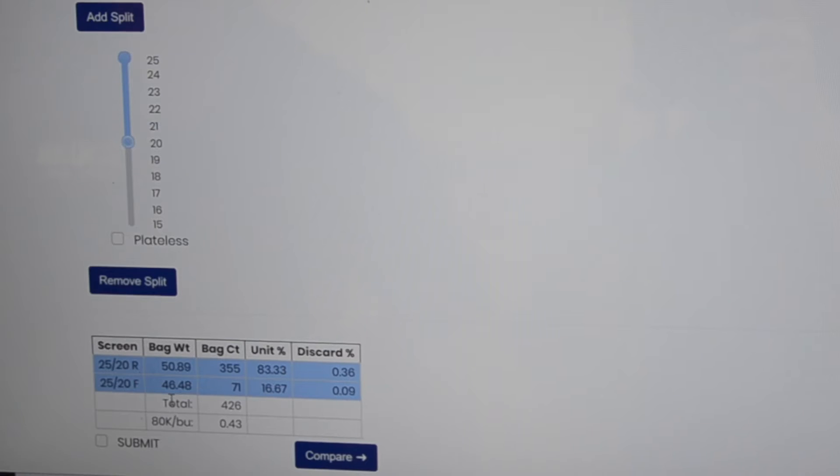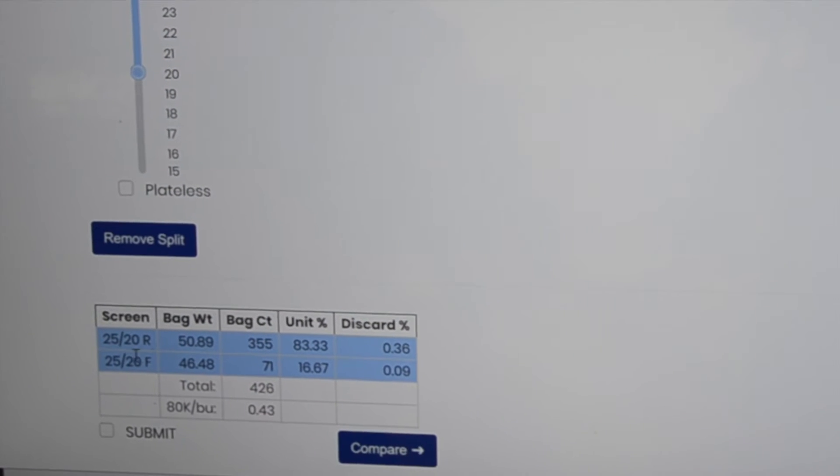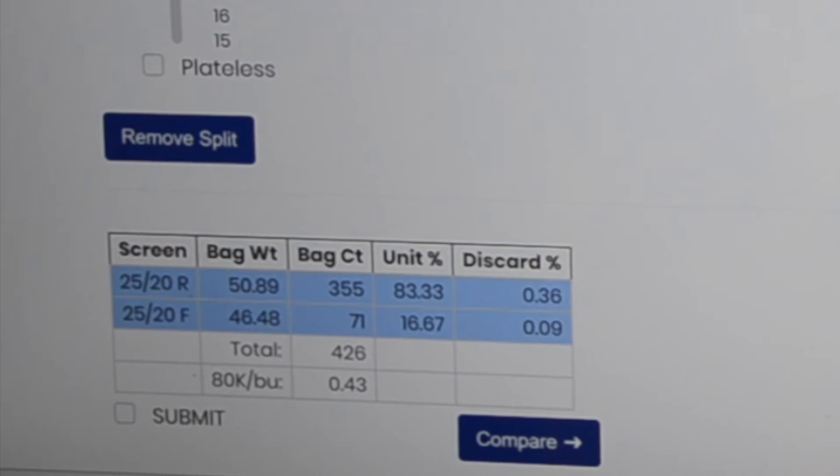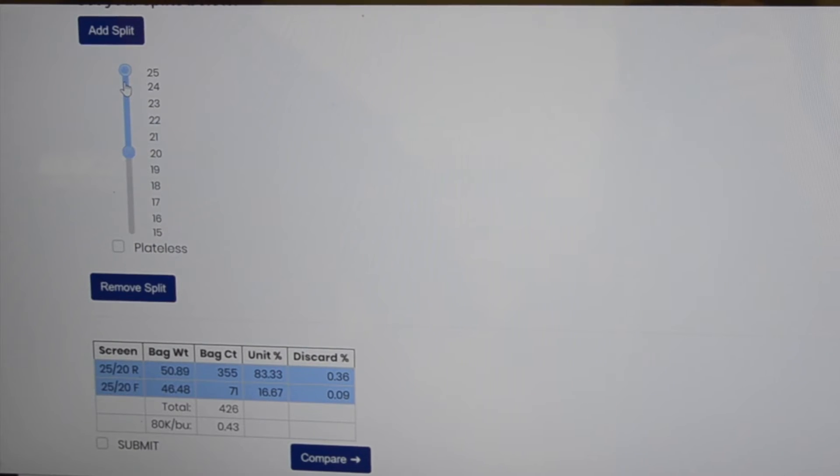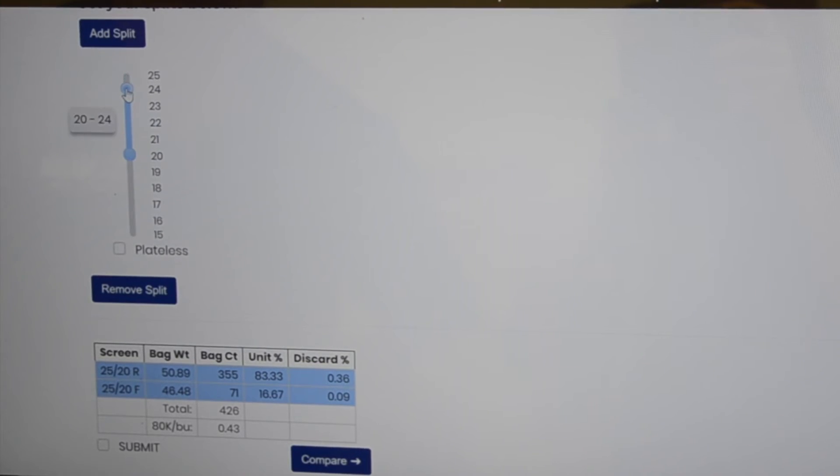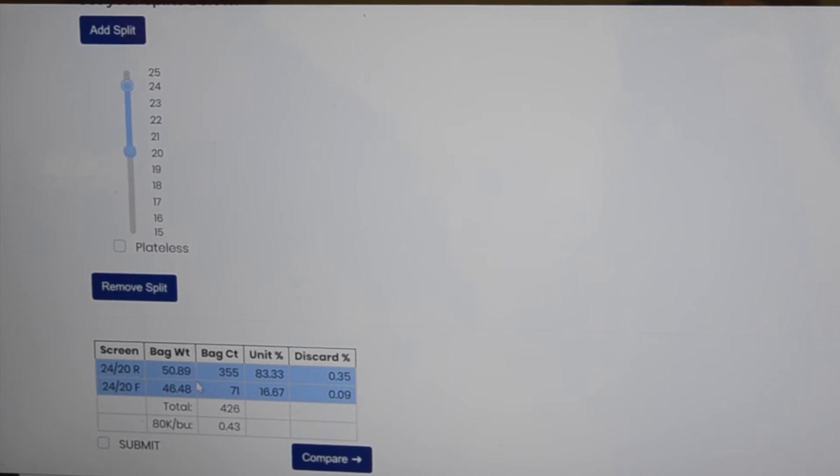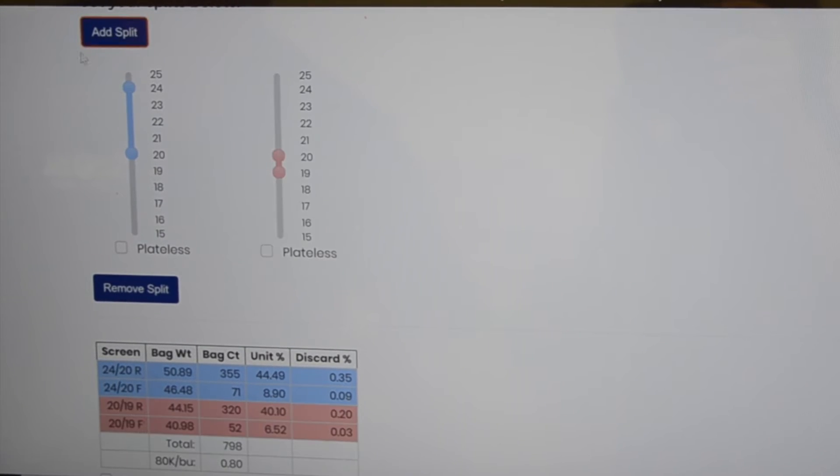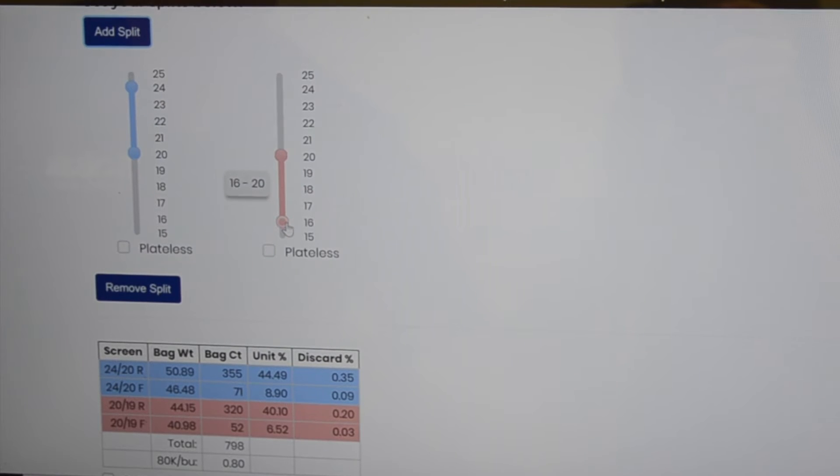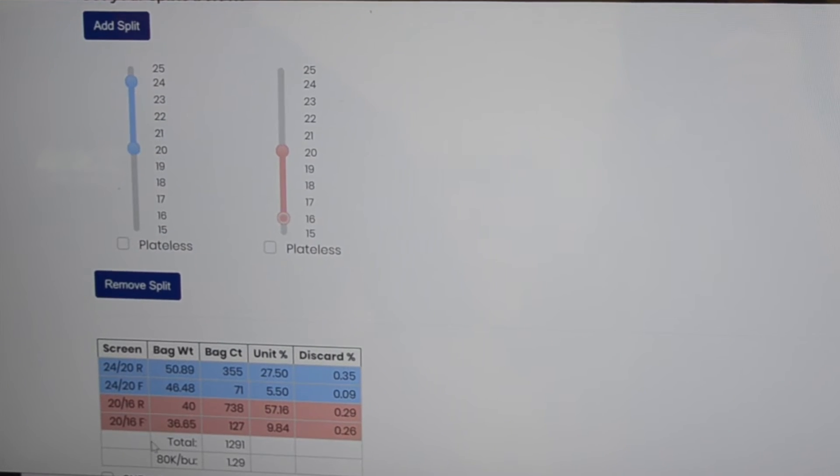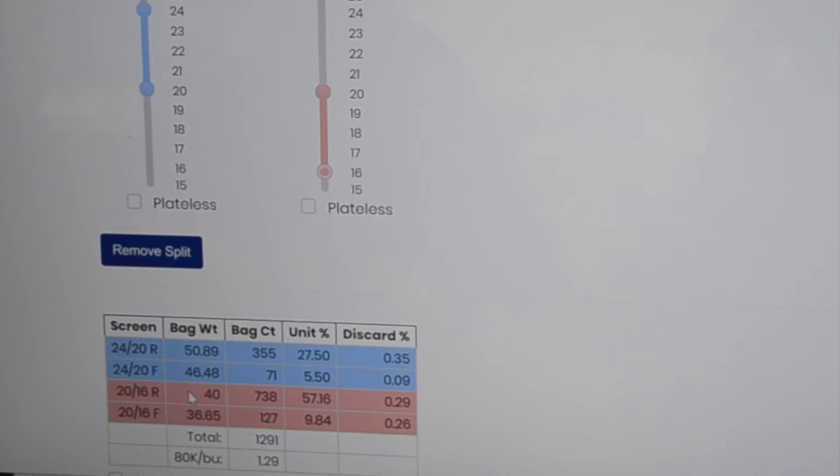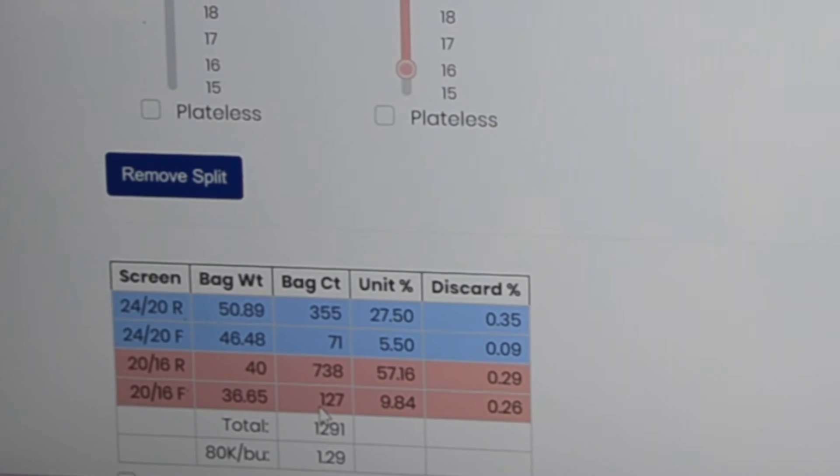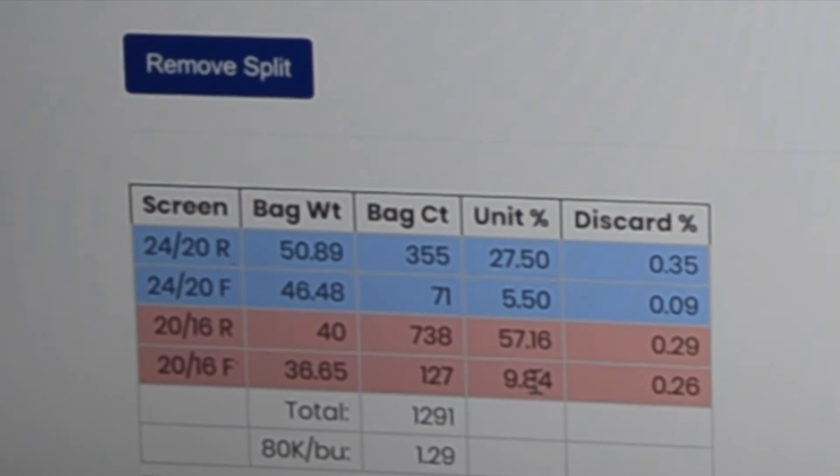Down here we put our first one in 25 20s. You get an estimated bag weight and count. We can go to 24 20. Then if we want to add the next split, we can go down to say a 20 16, and that shows you here the estimated bag weights, estimated counts, and percentage of the lot.